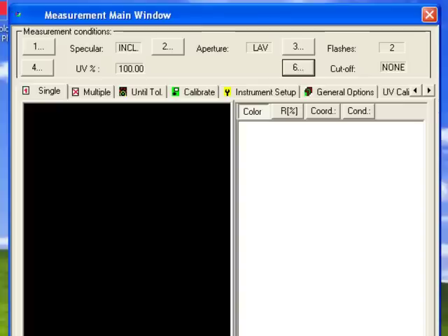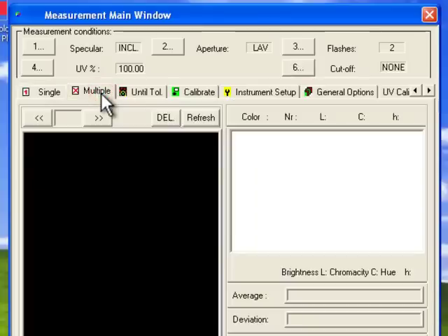Tabs are also available for further configuration, such as choosing options for single and multiple measurements.